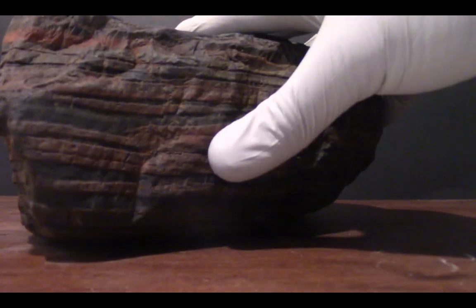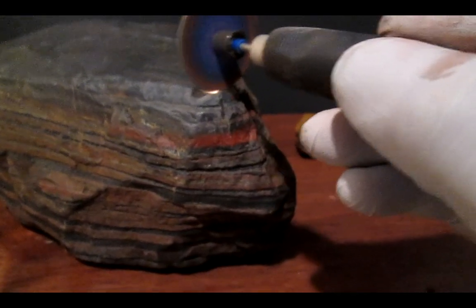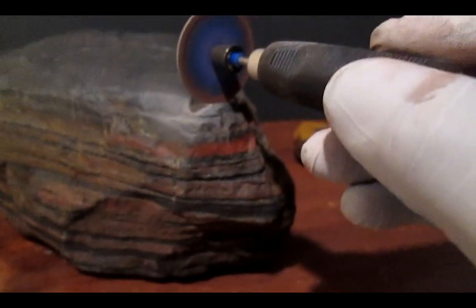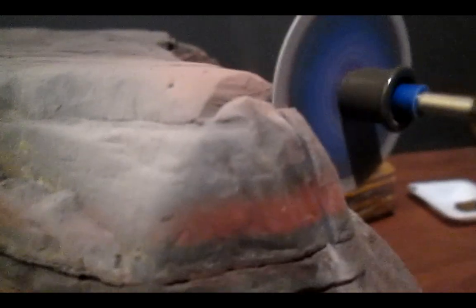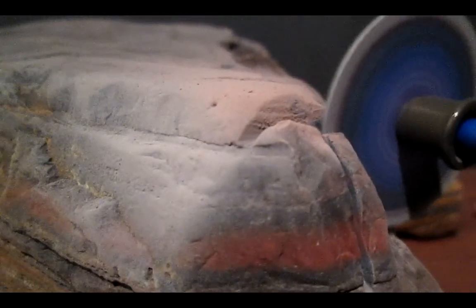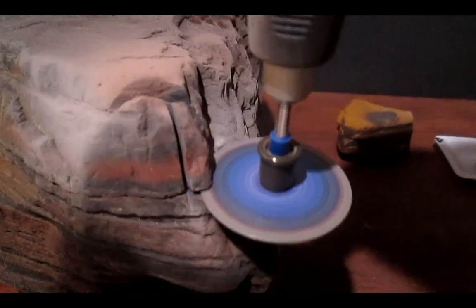So starting from this sedimentary rock, for example, I cut a small chunk from the area of the rock I wanted to measure. The neat thing about the banded iron formation is you could be sloppy when doing the cutting, because the iron oxide would dissolve almost completely in nitric and hydrochloric acid. And the sediment in between the layers is mostly silicate sand, so hydrofluoric acid will be needed to dissolve that.